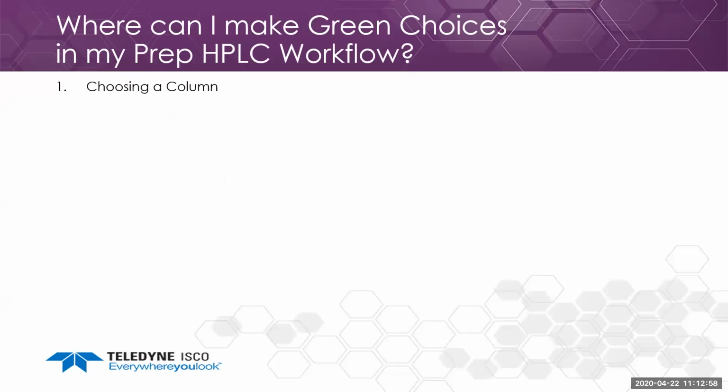What about for prep HPLC? So the workflow in general is very similar. You're choosing a column. In prep HPLC, most of the time we're going to be in a reverse phase system, and you're probably using a C18 media, but other reverse phase medias are also common.